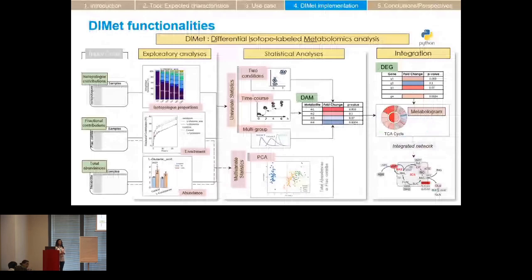Okay, so you can use any kind of labeled precursor to, for example, discover new pathways where this label gets incorporated. At the level of metabolograms, it is the user that defines the molecules that go in the pathway. So the example shows this very well. And indeed, for doing the representation of a network, it's work that will come in the future. It's not yet ready. Thank you.